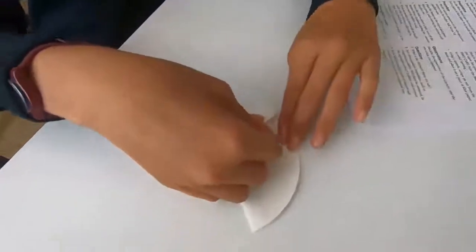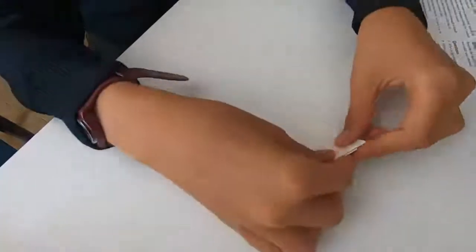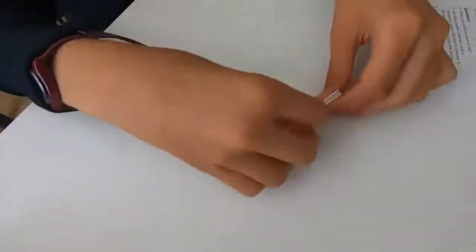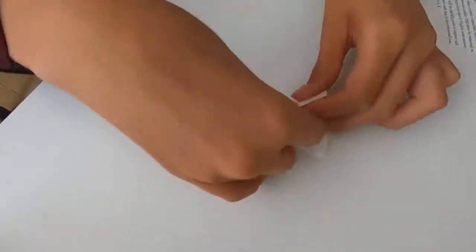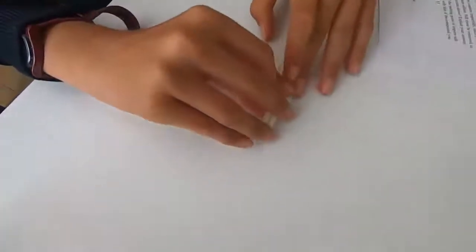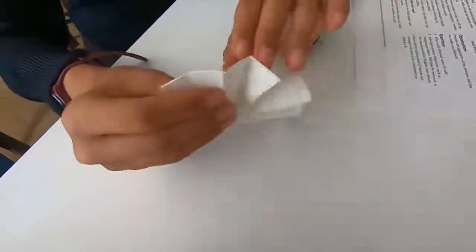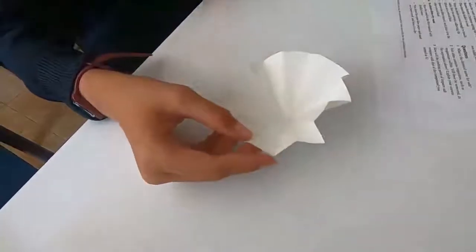So here we are folding it in a fan shape — you fold it in half and half again, then you open it up and you create this fan as shown here. Once you've got the fan, nicely folded with a few more folds, we open it up and we have a filter paper that we can actually use to filter.